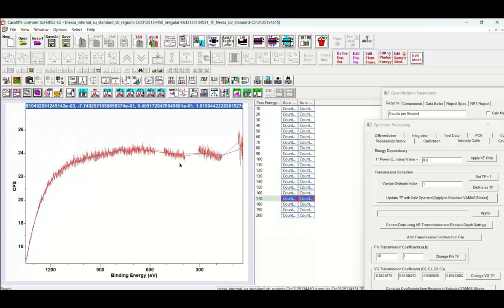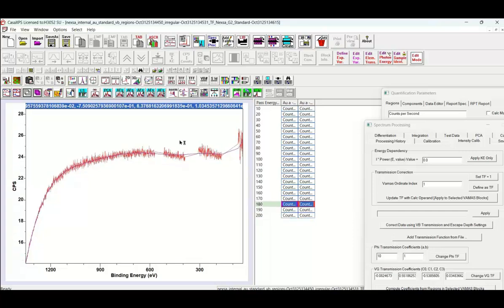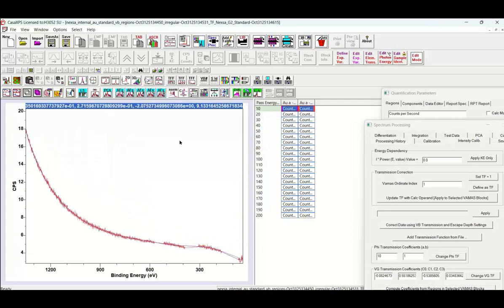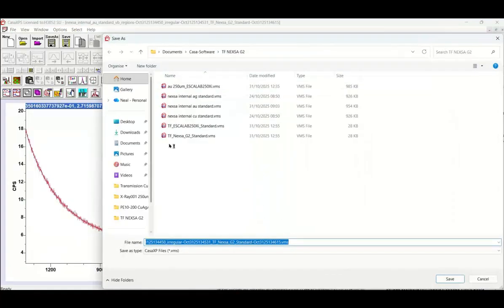Now we can see that there are some anomalies here associated with the higher pass energies, and maybe they're true, maybe they're not so true. Maybe we would have to do it again if we don't like the result. But let's have a look and see how well this is performing by applying it to the data, which involves once again saving these data.